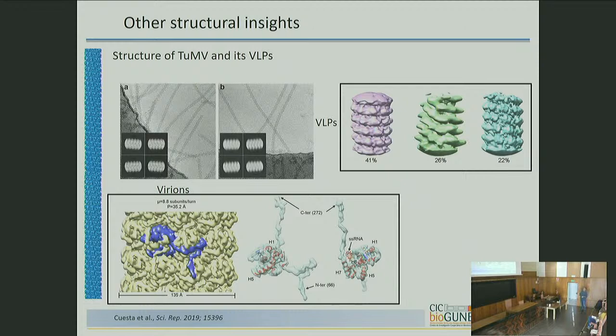Without symmetry, you can see here a classification, and there is no clear definition. So the absence of the RNA means you are really losing a good interaction between the proteins in the final filament. Even if it looks nice at low resolution, if you try to define it at high resolution, you get nothing.